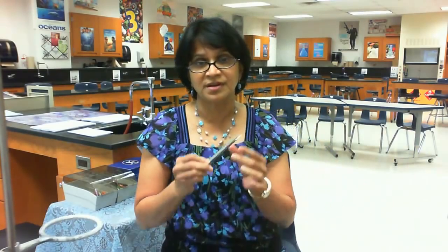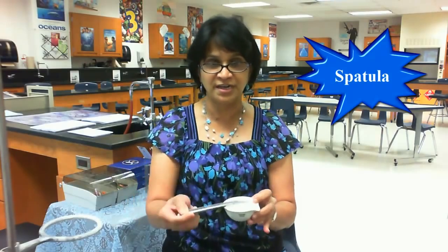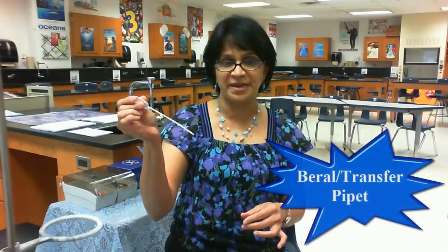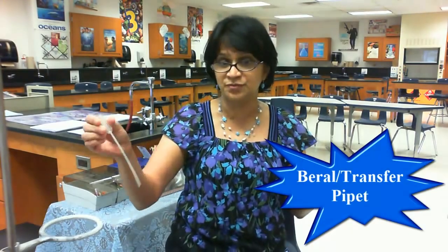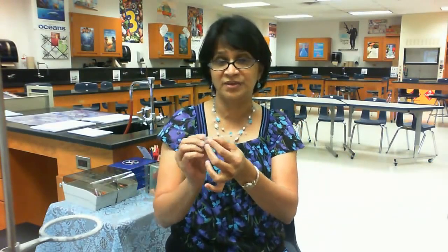Then we have a spatula. A spatula is used for measuring or transferring some solid material. If we have to transfer some liquid, what we have is a beral pipette or transfer pipette. We use it to transfer from one container to another container. There is no measurement on that. We can just consider the drops for that.